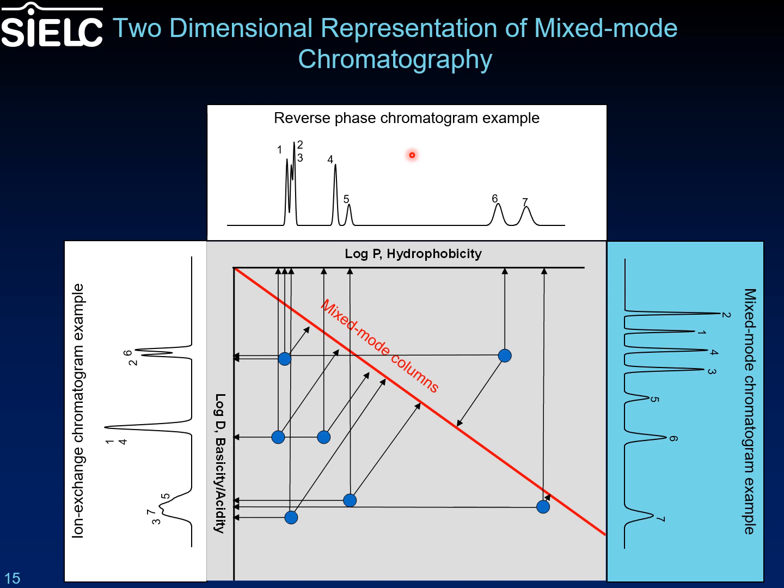On the horizontal axis, we have reverse phase chromatography being transposed. Similarly, the log P is a measure of the hydrophobicity, and so if a compound is close to the origin point of the plot, has a lower retention time, it is less hydrophobic than those that appear farther away. It is possible to take these two graphs and, in a two-dimensional axis pattern, graph them against one another, and average the data point wherein different compound peaks should appear.